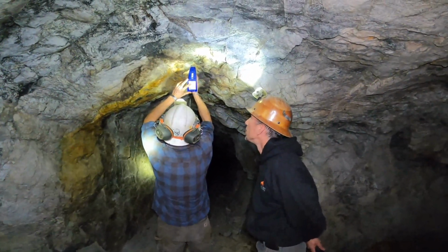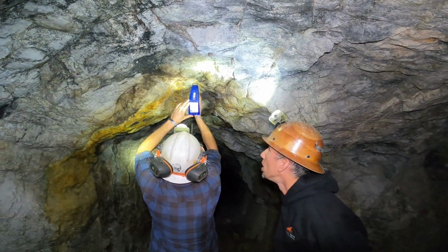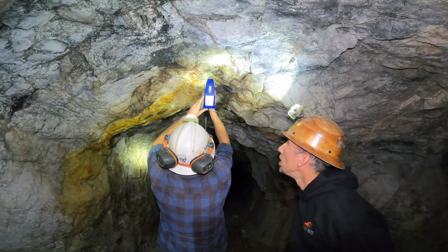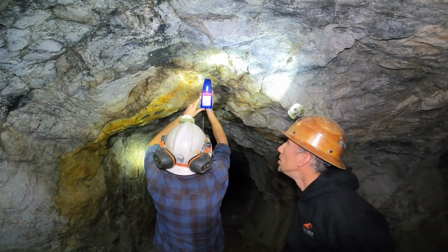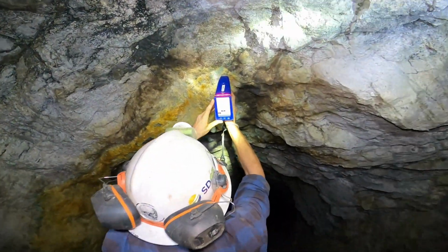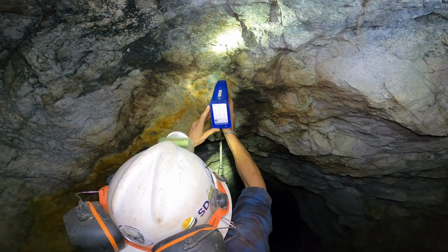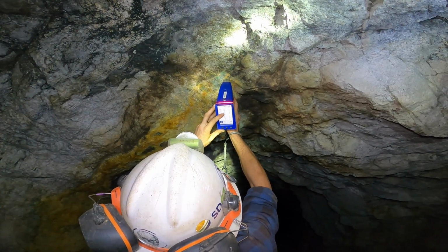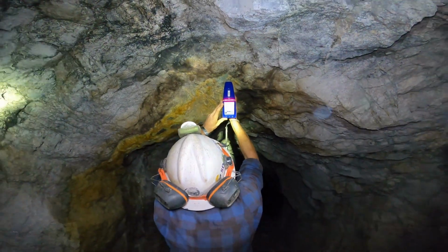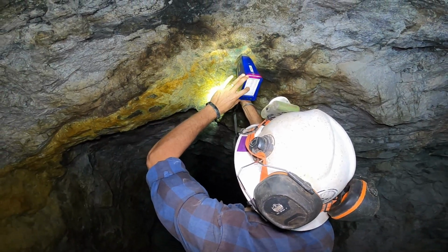Copper, 2.5%. Oh, he's trying to see it. I'm gonna scratch a penny up there first so you can see. There it is. Oh, I dropped it. So 5 and 4. There's 1 part per million gold. Now it's 5, 5. Now it's not there. So 3.2% on copper up there.